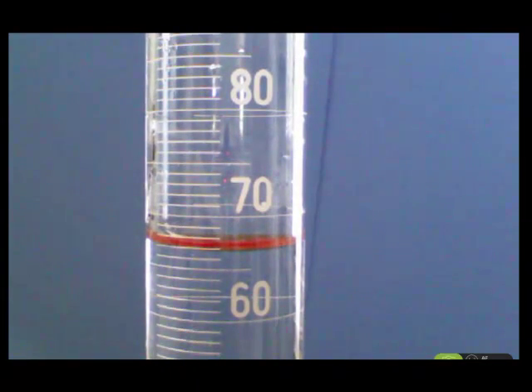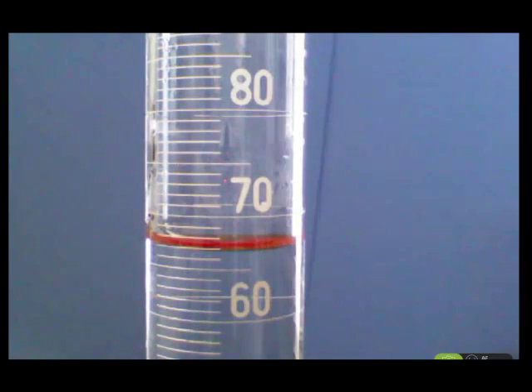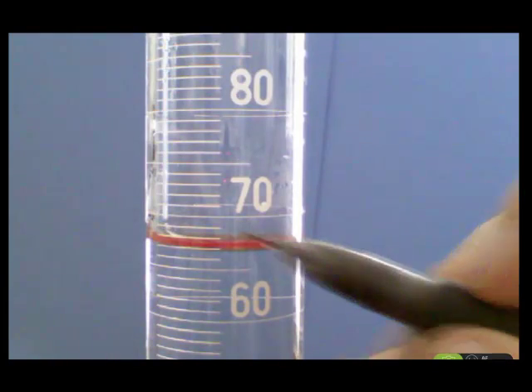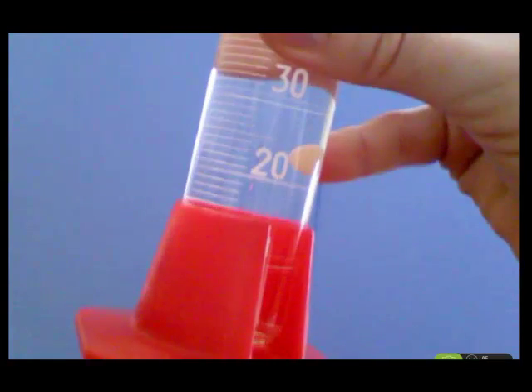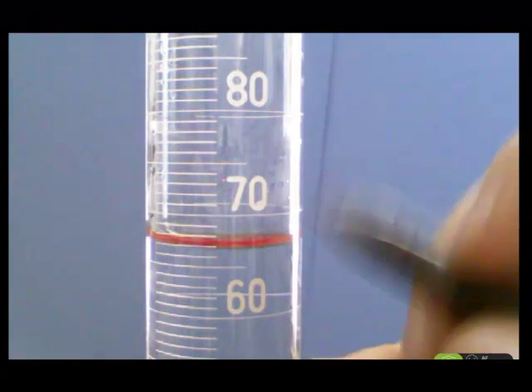Okay, so let's talk about how to measure and record volumes in the lab. I have here a graduated cylinder, and in that graduated cylinder I've put some water. Notice the surface of the water looks red, and it also looks like it has sort of a thickness to it. The reason why it looks red is because the base of the graduated cylinder is red, and it's reflecting the light, the red colored light, up to the surface of that water.